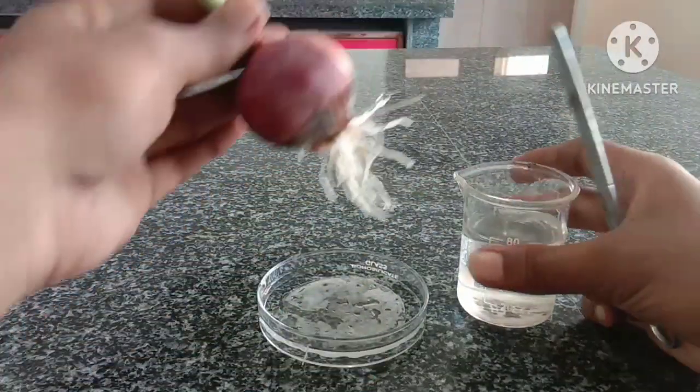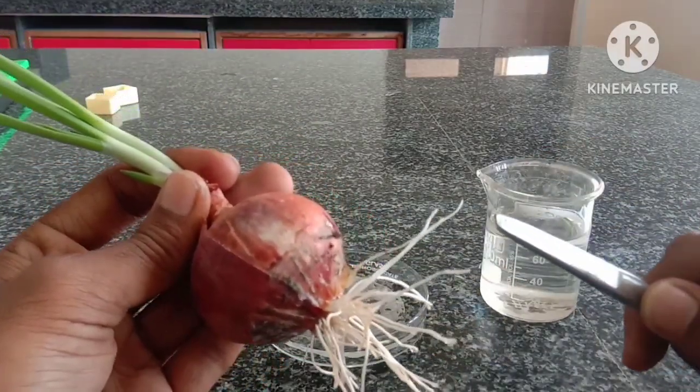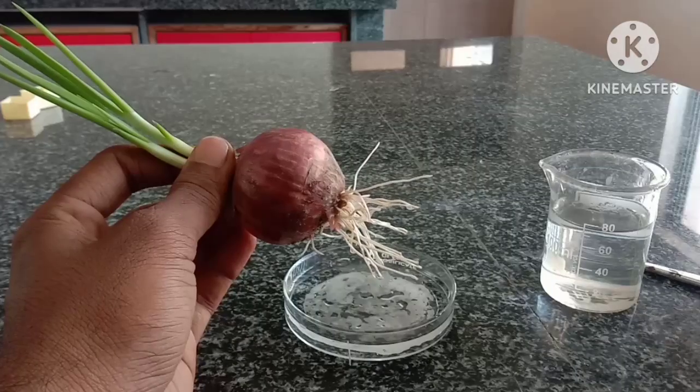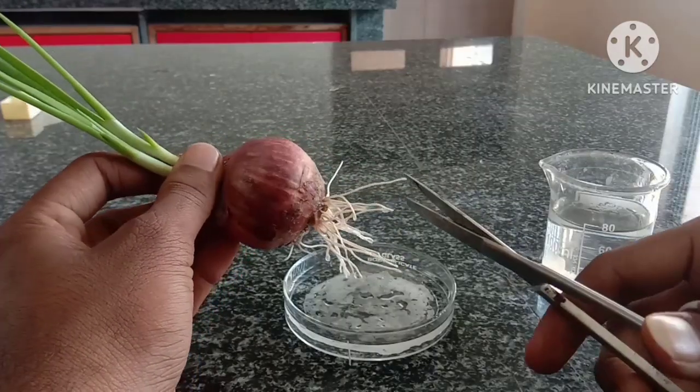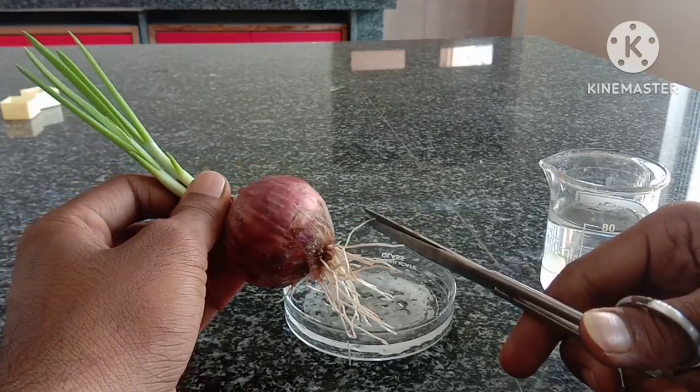Take an onion bulb which has roots. These are the root tips — we have to cut these root tips to perform mitosis. Cut the root tips with the help of scissors, like this.